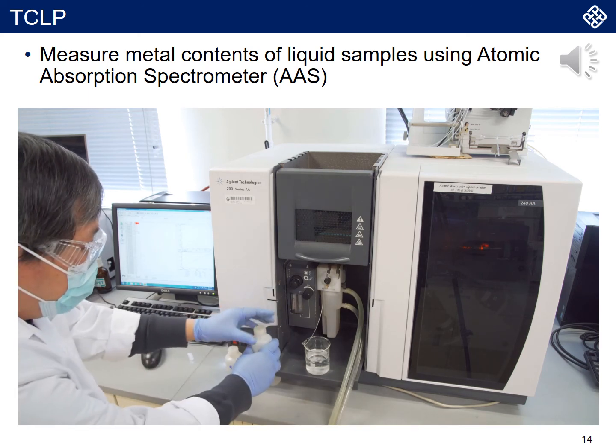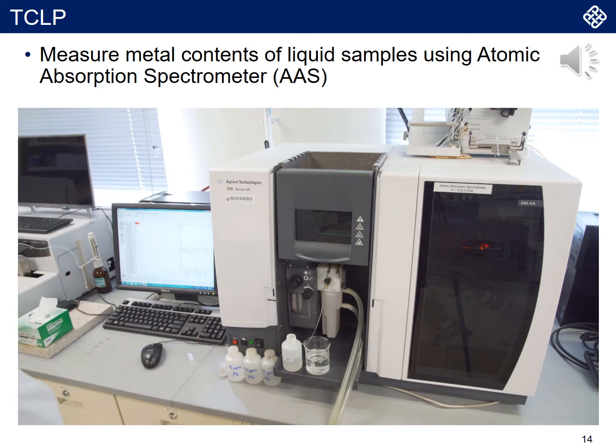Now we are putting our first sample in to do the measurement. Of course, the operation of this analytical tool needs a good expert to operate it, and these instruments also need a standard curve using a fixed amount or concentration of the metal to calibrate it.